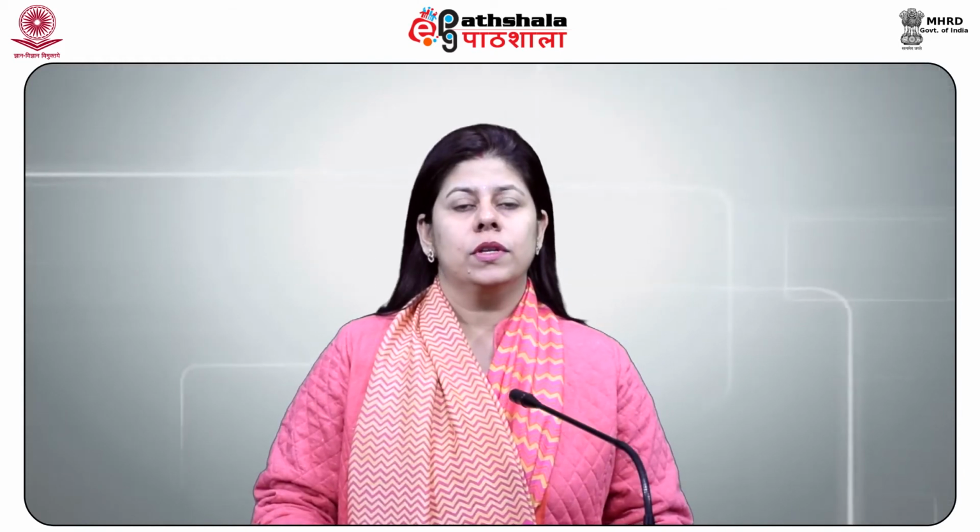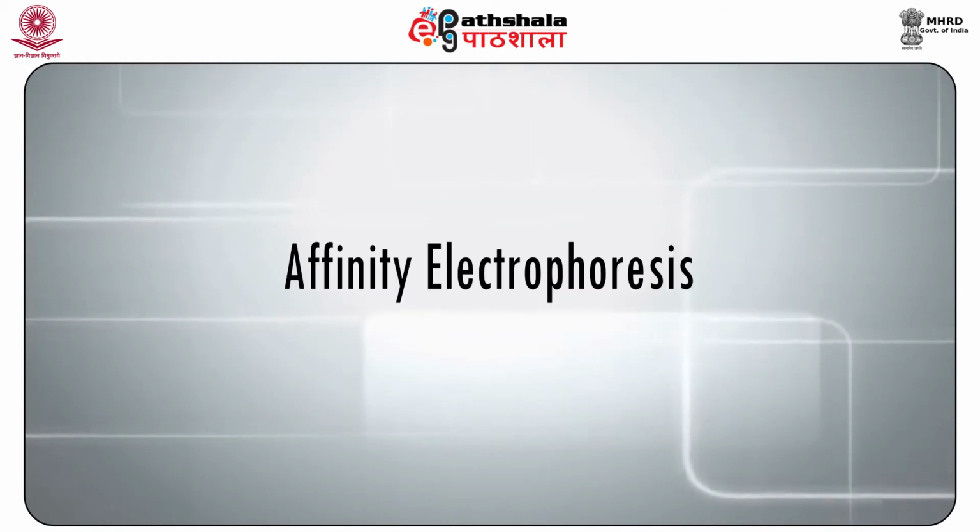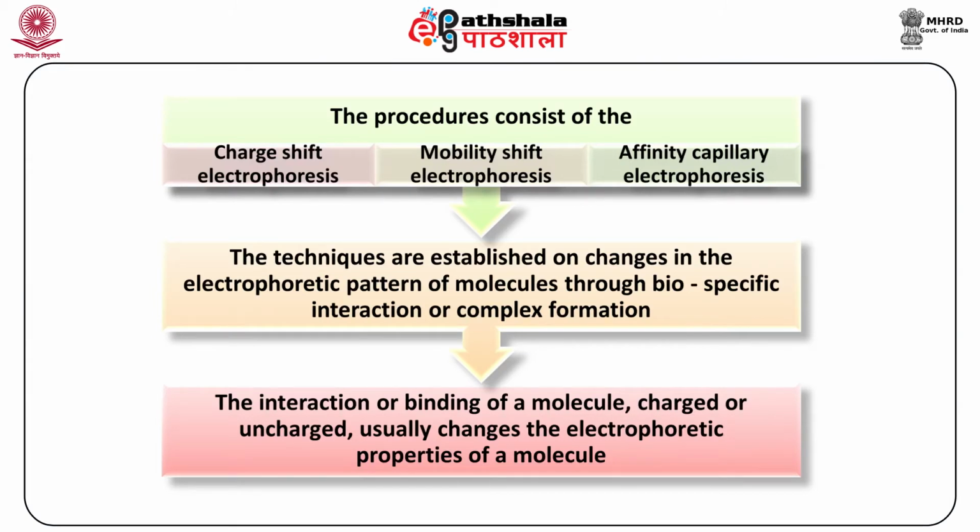Types of electrophoresis. Affinity electrophoresis. The procedure consists of charge shift electrophoresis, mobility shift electrophoresis and affinity capillary electrophoresis. The techniques are established on changes in the electrophoretic pattern of a molecule through biospecific interaction or complex formation. The interaction or binding of a molecule, charged or uncharged, usually changes the electrophoretic properties of the molecule.